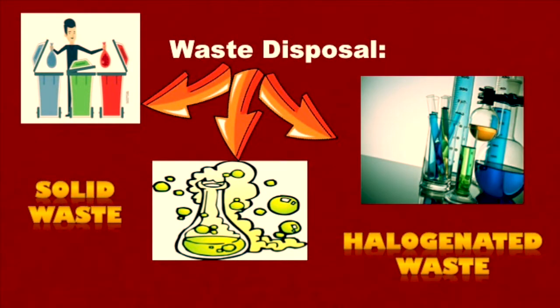For the first part of this experiment, in the preparation of polystyrene, dispose of solid polystyrene and parafilm in the solid waste container. Do not dispose of any solid polymers in a non-halogenated waste container. In the second part of this experiment, in the preparation of Nylon-6-6, rinse the solid nylon with water and blot it dry with a paper towel. Dispose of all nylon waste in the solid waste container. Any remaining aqueous solution should be disposed of in the halogenated waste container.